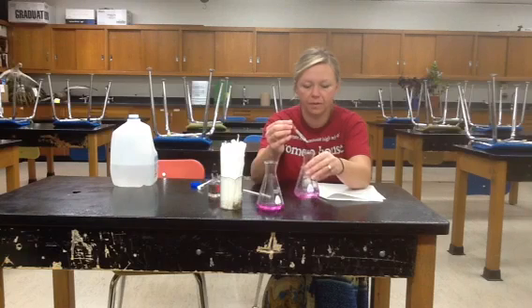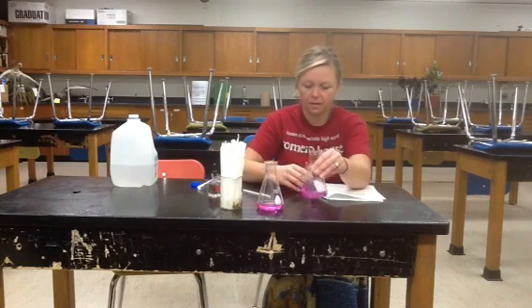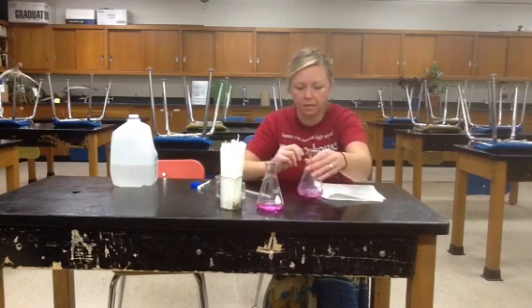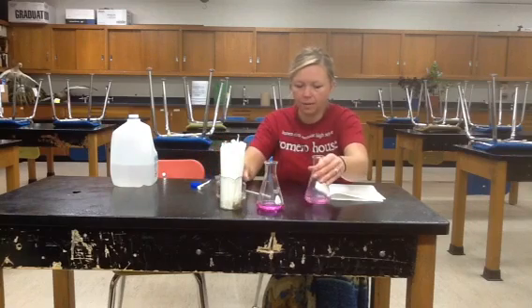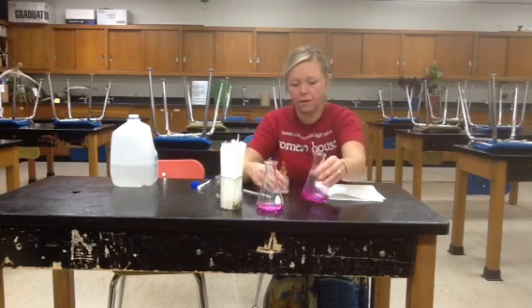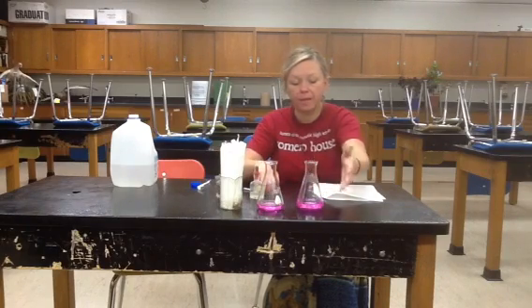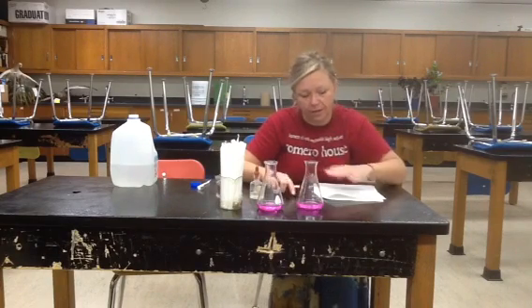That was 1 drop. And that's 2 drops. By the way, when you're doing this, make sure that you have your phenolphthalein and your sodium hydroxide straight. Don't mix them up when you're adding the drops, or it won't work. Okay, I'm going to add 1 more drop. This is probably going to be the same amount for each. Anyway, now we have our pink color. It's going to be the same amount of drops probably while I'm demoing this, because I'm not doing any exercising. Sorry. Alright, so now you've got your pink color restored again.